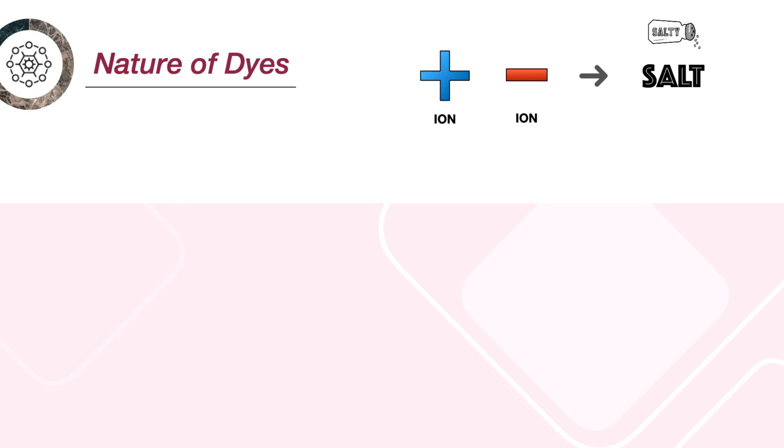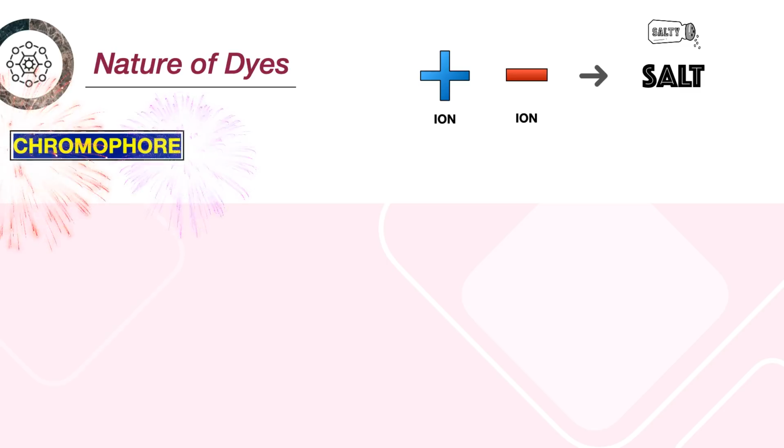If the ion contains the coloring material, or this is the ion that contains the color, ito yung magbibigay ng kulay sa bacteria or sa bacterial structure, we call that ion as the chromophore. Okay, again, the ion, it could be the positive ion or the negative ion. Okay? Depende kung positive ion or negative ion. Depende sa kung sino sa kanila ang may kulay. Okay? That would make it now called the chromophore.